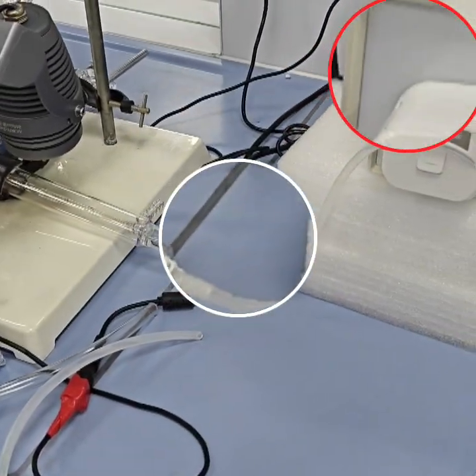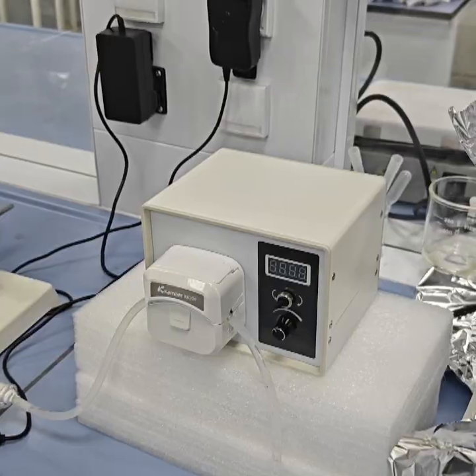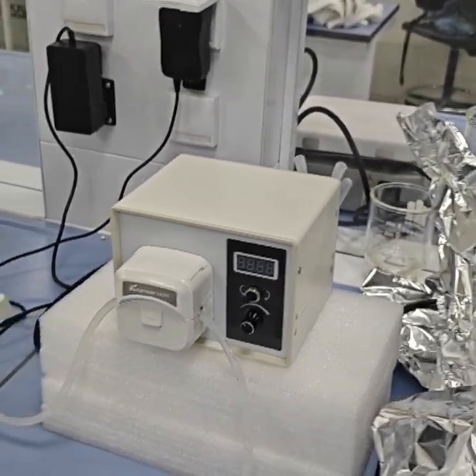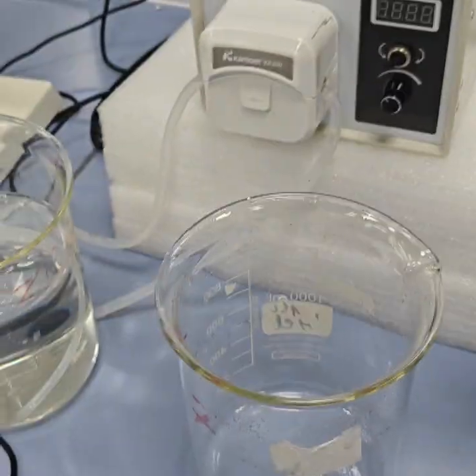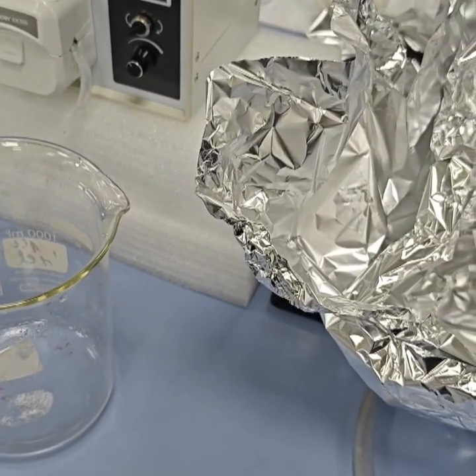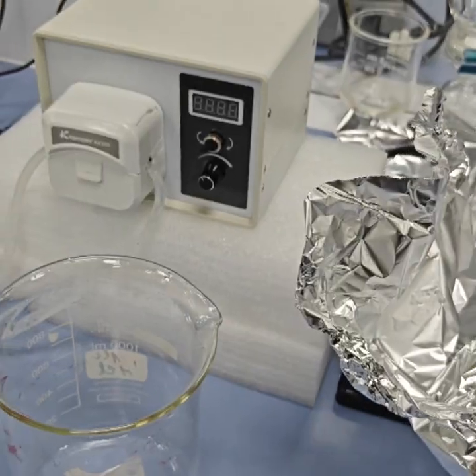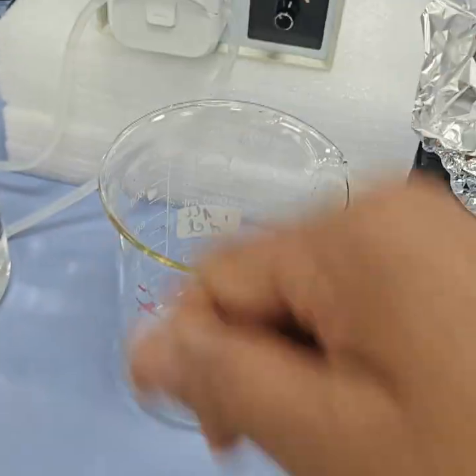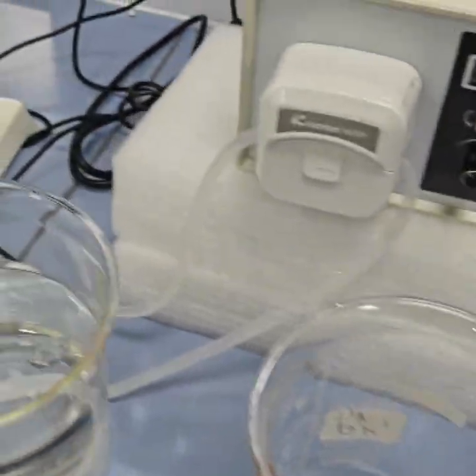Hello viewers, in today's video we will learn about a simple continuous flow experimental setup, where you can see there is one pipe here. This is the continuous flow treatment system, where the water continuously enters the reactor from this pipe and interacts with the treatment material. So here is my treatment material.